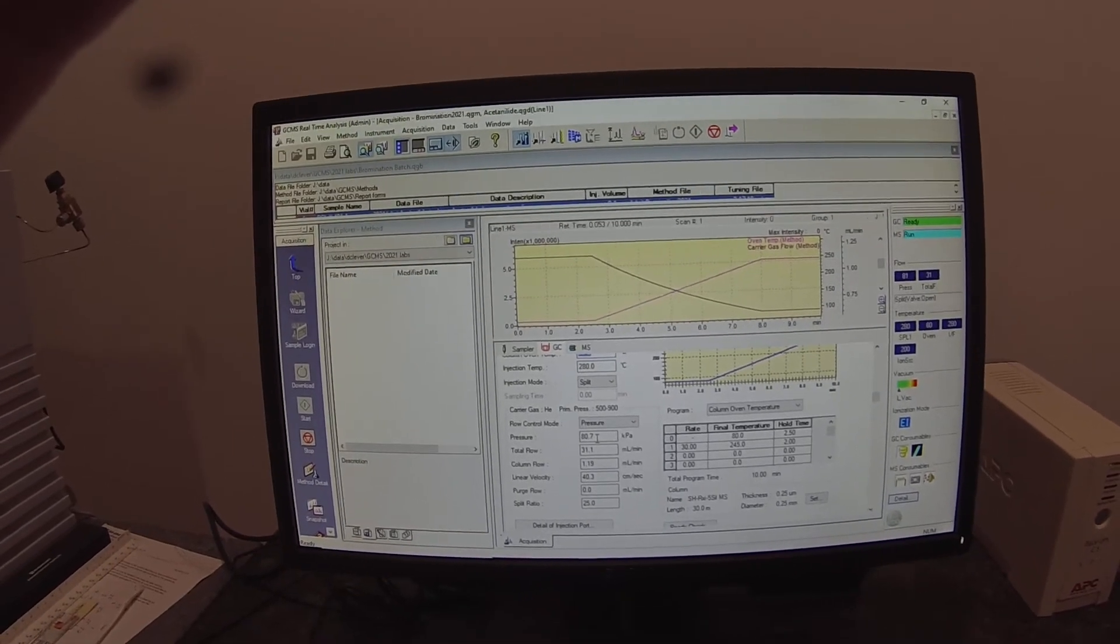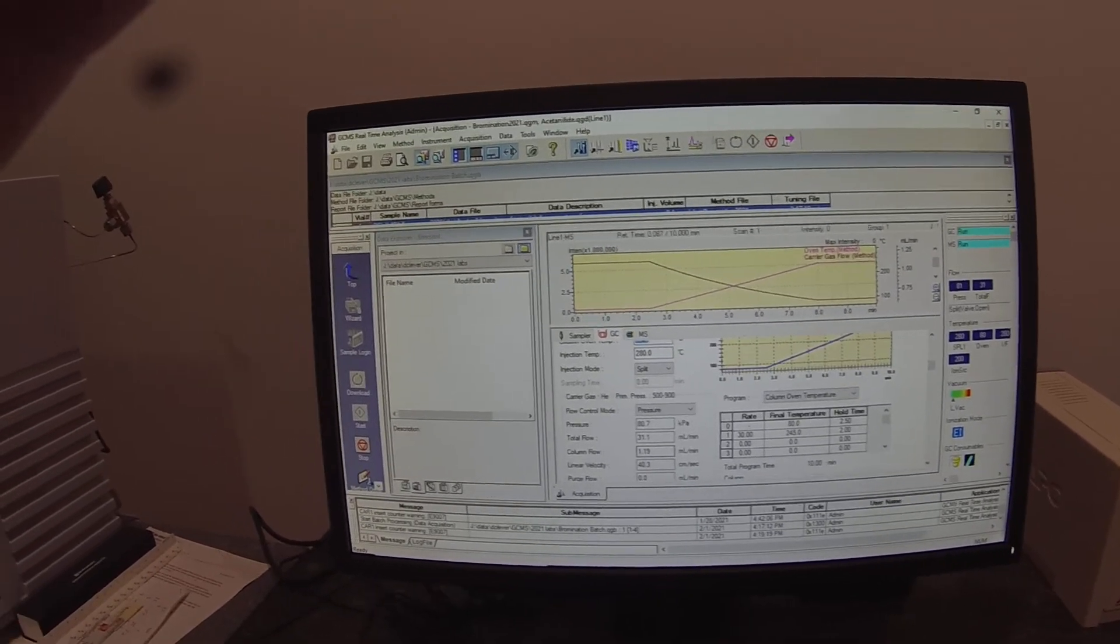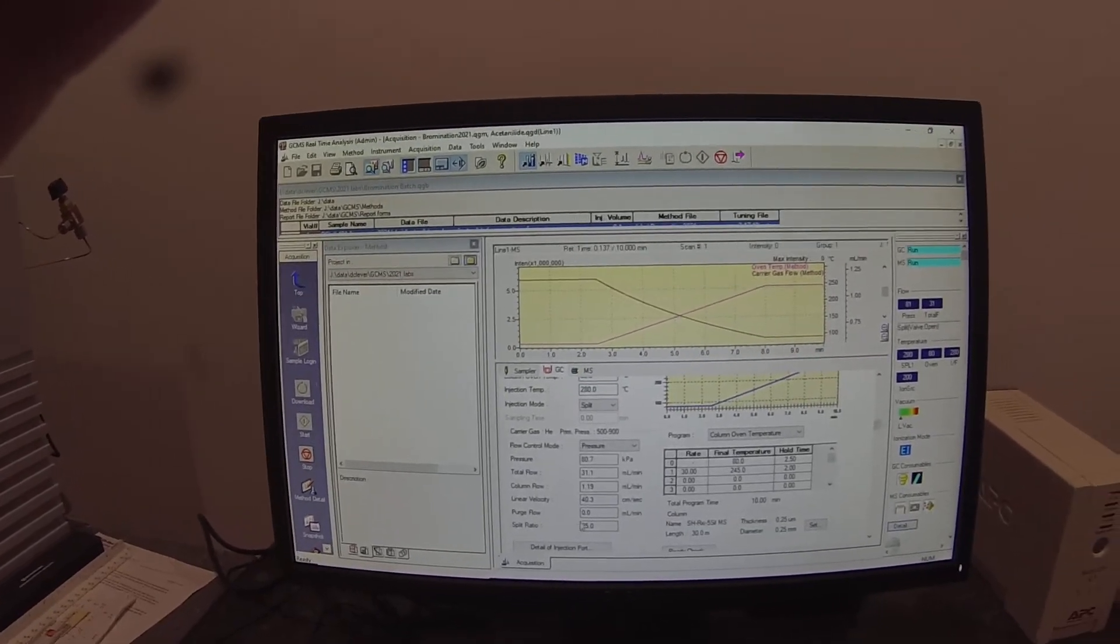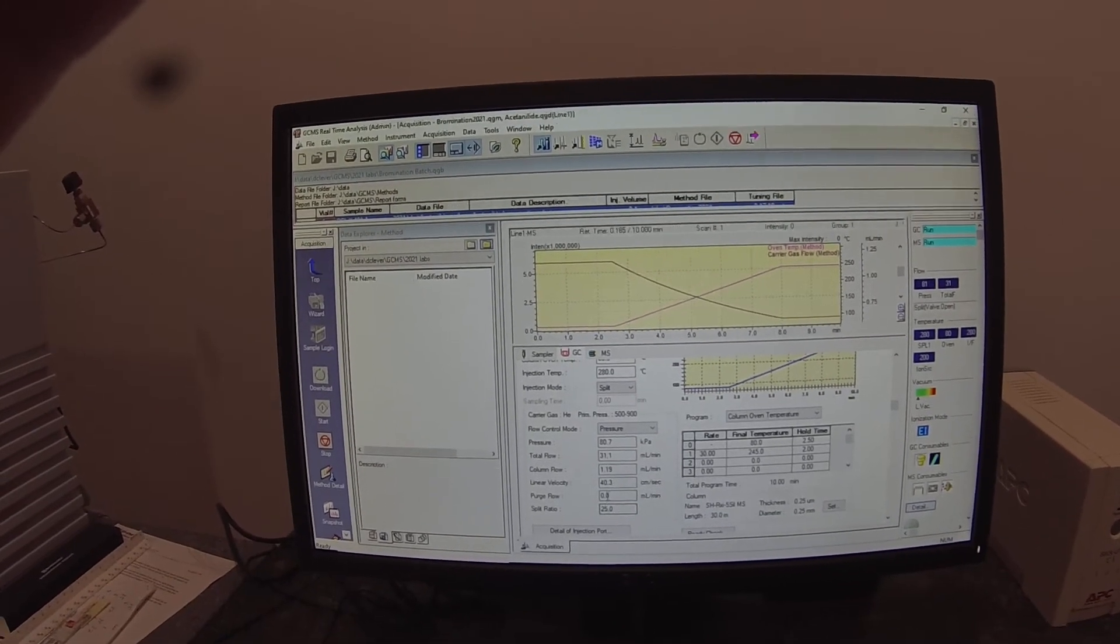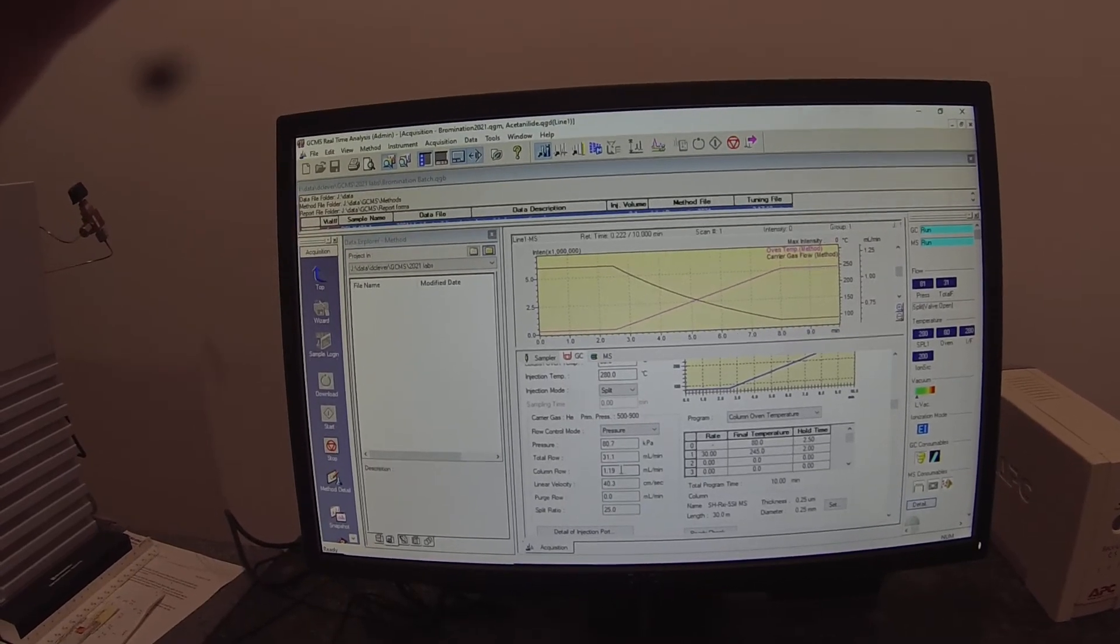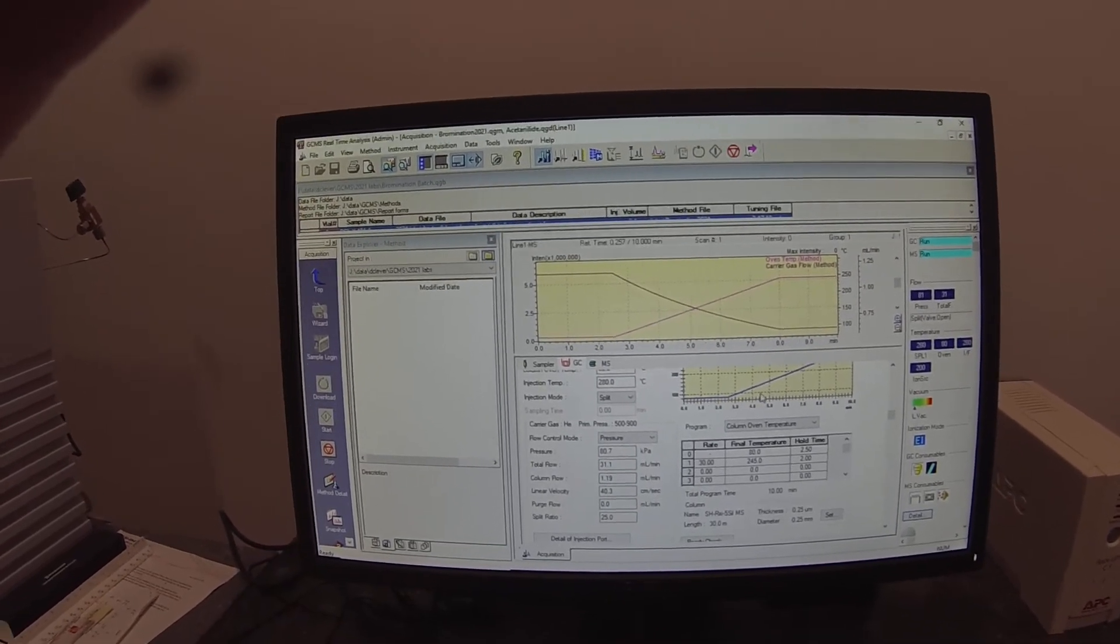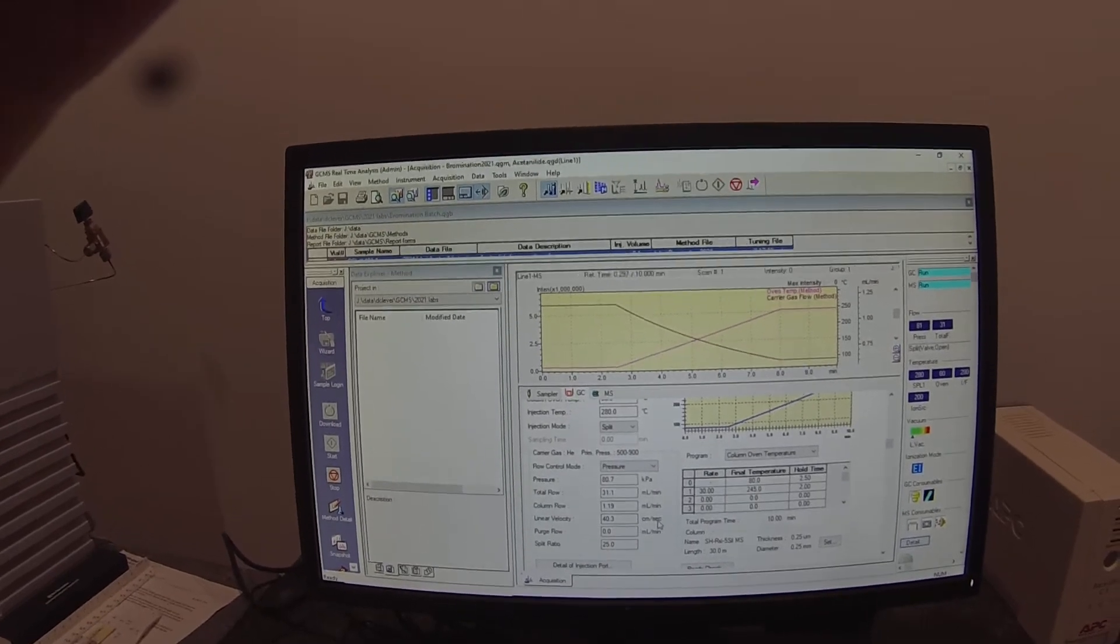And our pressure is at 80.7 kilopascals. We're running a split ratio of 25 and a column flow rate of 1.19 milliliters per minute at this temperature which corresponds to 40.3 centimeters per second.